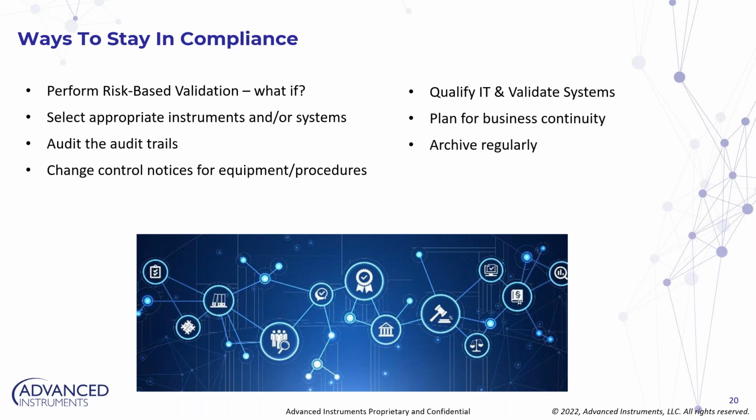Can we get that to LDAP-S? And can the vendor or can the instrument support that? Archiving regularly, right? So maybe you have an archival built into your business practices, where after a certain time the data stays within the LIMS system or within your network, it then gets archived separately and managed by so-and-so person.